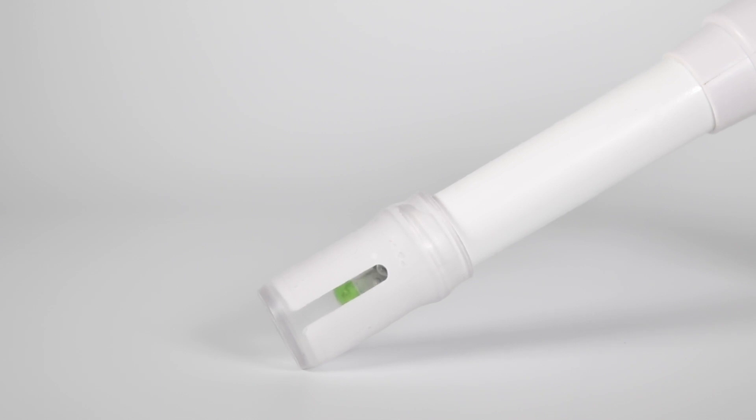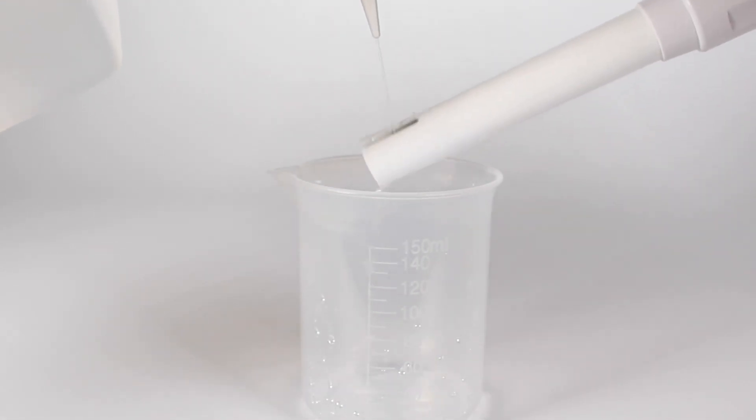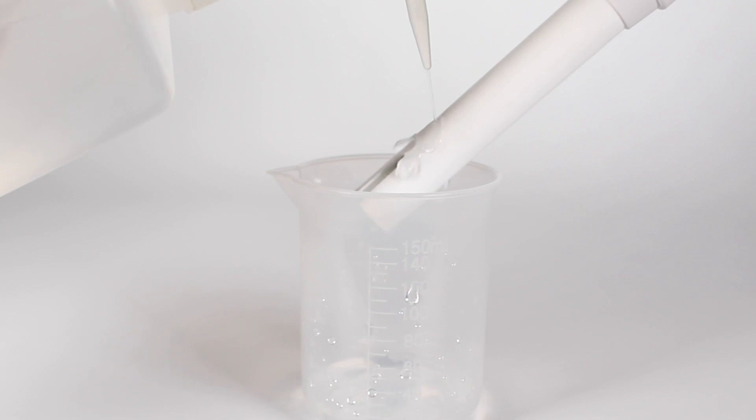The first step of calibration is to rinse. Rinse your probe for 10 seconds with distilled water to dissolve any KCl (potassium chloride) crystals left from the storage solution. Tap water is okay if distilled is not available to you. It only takes a small amount of storage solution to contaminate calibration solution.